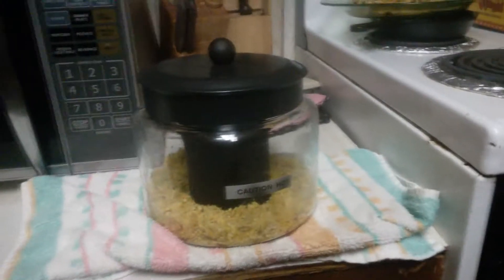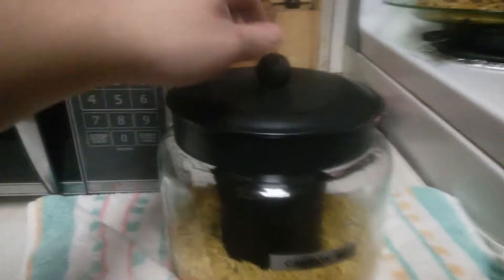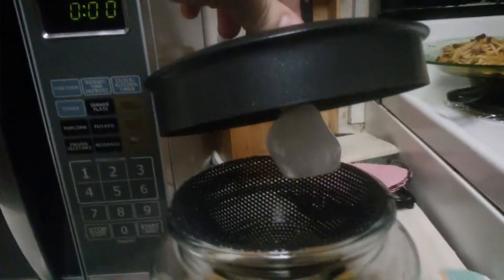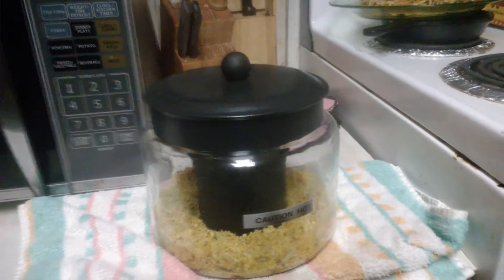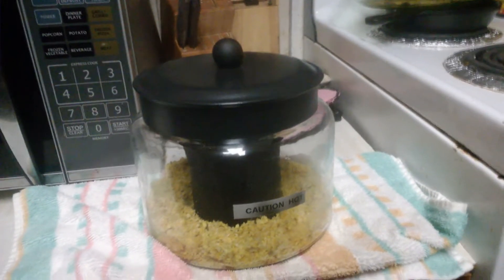We've taken the SNX 100 out of the microwave. As you can see, there's still a little bit of ice here, which is really what you want. So we're going to move this over to the beaker and see how much oil we collected.